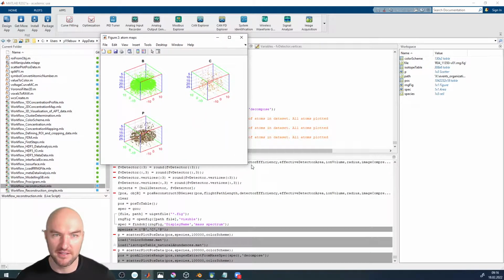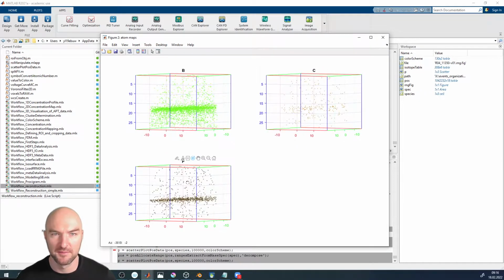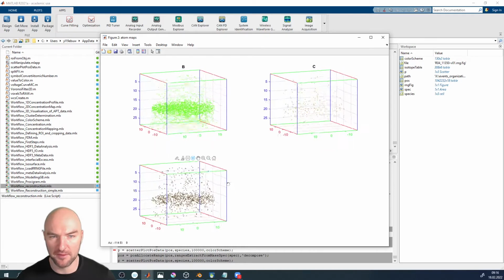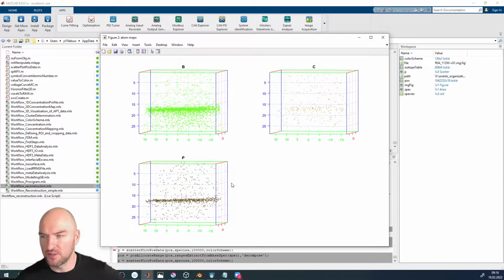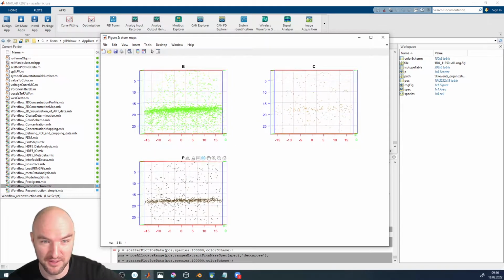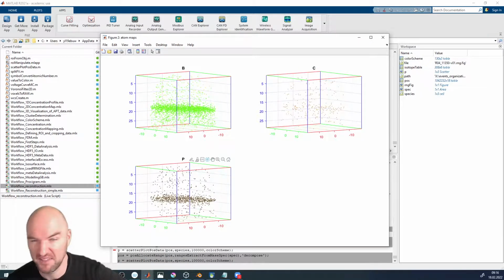Okay, and so you can see, yeah, boron's pretty good, phosphorus pretty good. We have this very nice grain boundary here, and we want to do a proximity histogram. Obviously, you could argue with this grain boundary, you might just do a 1D concentration profile with a cylinder that you align to the grain boundary. Why not?